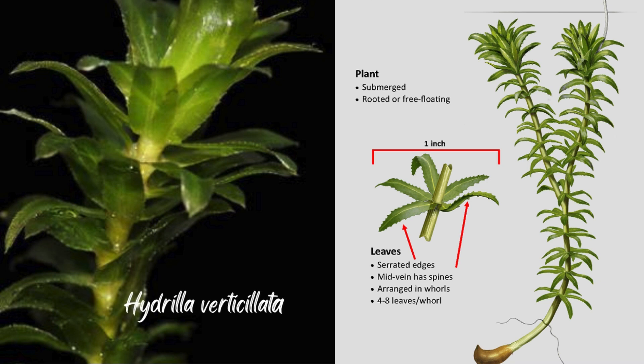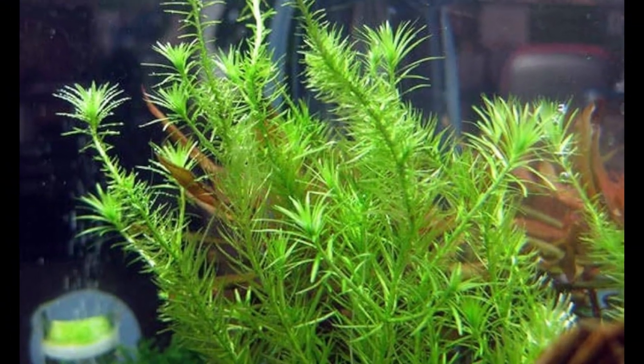Hydrilla leaves are very thin, so a minimum number of cell layers are in these leaves. Clearly, a lot of chloroplasts can be seen under light microscope at high power.